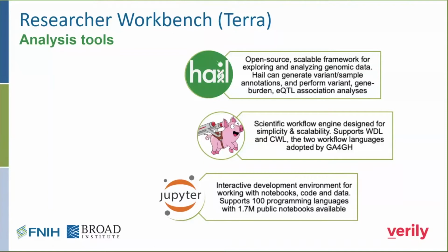And the third integrated analysis tool is Jupyter Notebooks. Terra has an interactive development environment for working with notebooks, code, and data in Jupyter Notebooks, and we will go through that as well. There are several template notebooks on the Terra platform that you can use, and I'll talk about those, and specifically the AMP-PD ones that exist. Can I have the next slide?